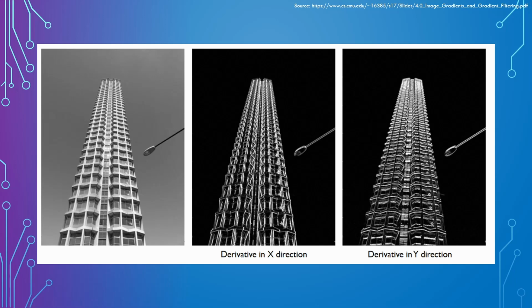So the outline of what we're doing is going to be like this. We have 4 different images of a bismuth crystal. We're going to load them into Python. And then we're going to take the derivative, or the difference between each pixel, of all 4 images. And then we're going to select the highest values of those image derivatives among the 4 different images, and take those highest pixels and construct our fully in-focus image.